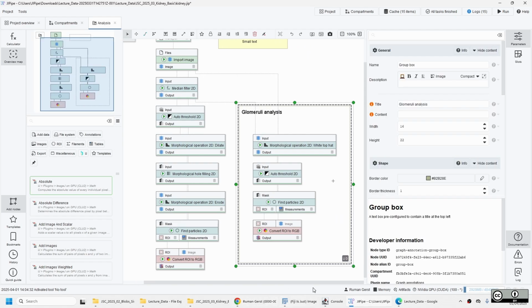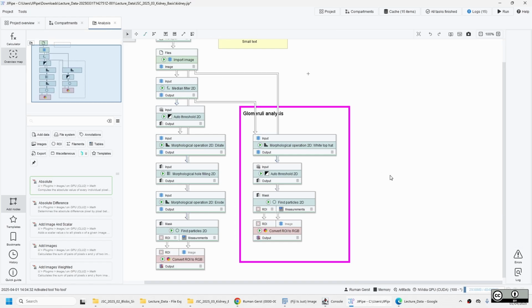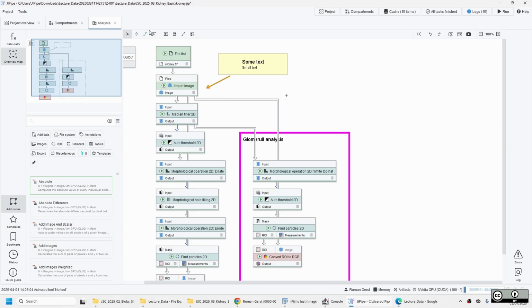And these you can also modify. What my colleagues usually do is make them a bit brighter and nicer. So, for example, the outline, make it a bit thicker so you can visually identify these more easily. You can always edit them and change their size, unlike the standard nodes. Then you also have arrows if you want to show something. And then you can also embed images. So simple, small images you can do with this image tool.